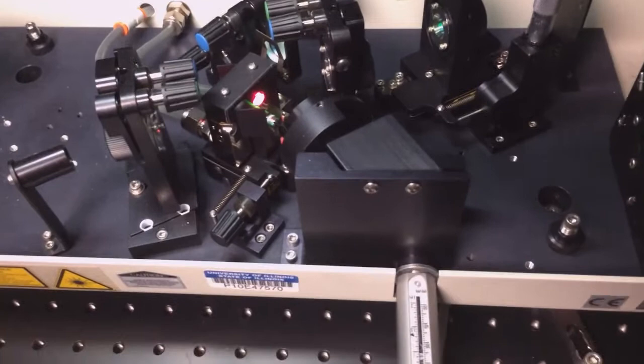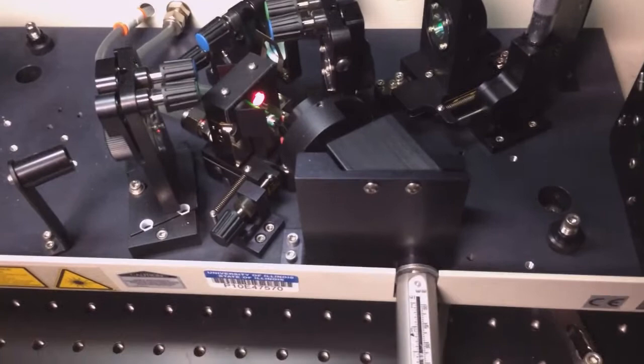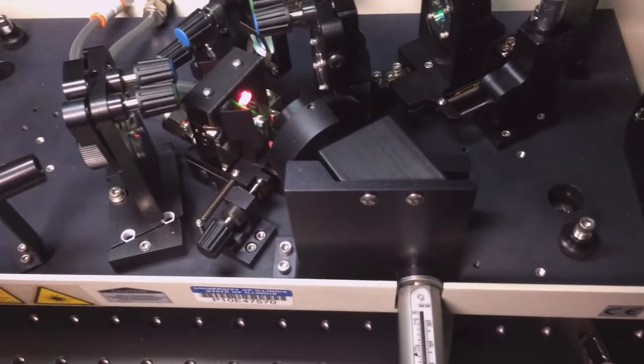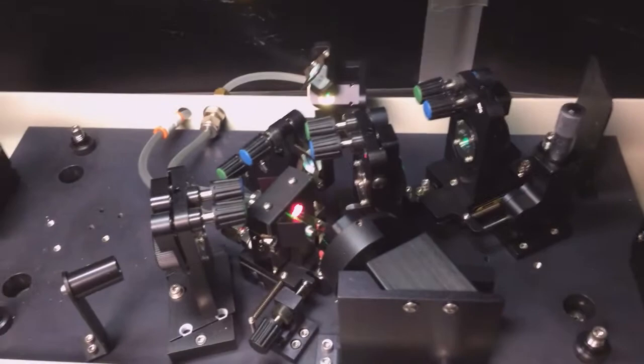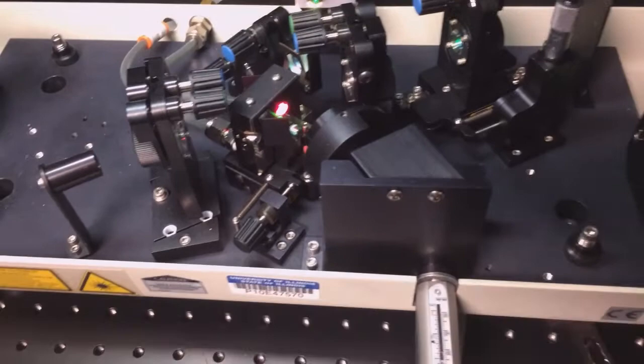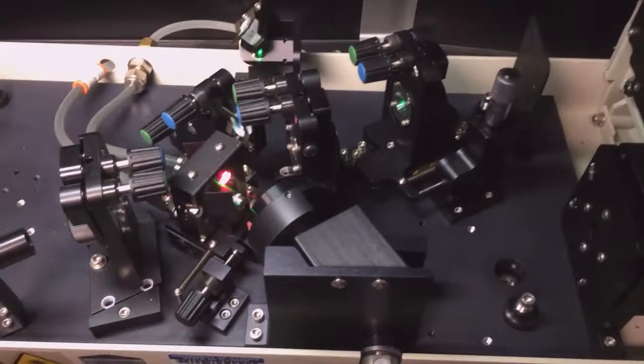So after lasing is achieved upon some initial alignment, then it can be necessary to get better efficiency to slowly translate the output coupler and the back reflector through the mirrors so that the cavity mode aligns better with the 532 beam.